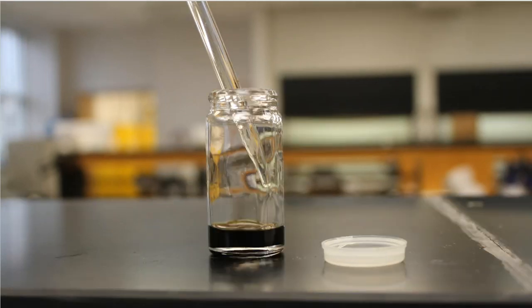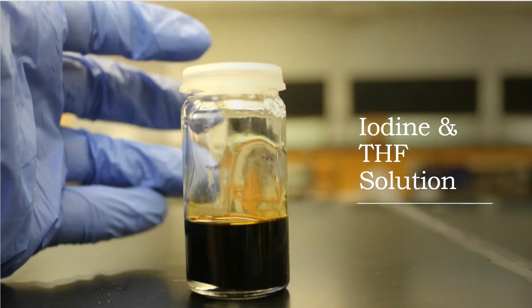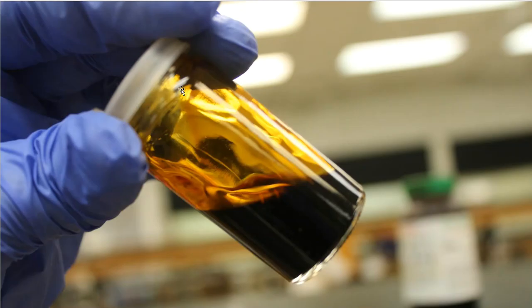As I added THF to that container, folks, this is what you see happen to that solution, so that you can make your observations the way you need to. Then I put a cap on it, and that allowed me to grab hold of the vial and shake, shake, shake. That's exactly what I did for a few minutes, just to make sure the iodine crystals were dissolved. In the next step, here we go.